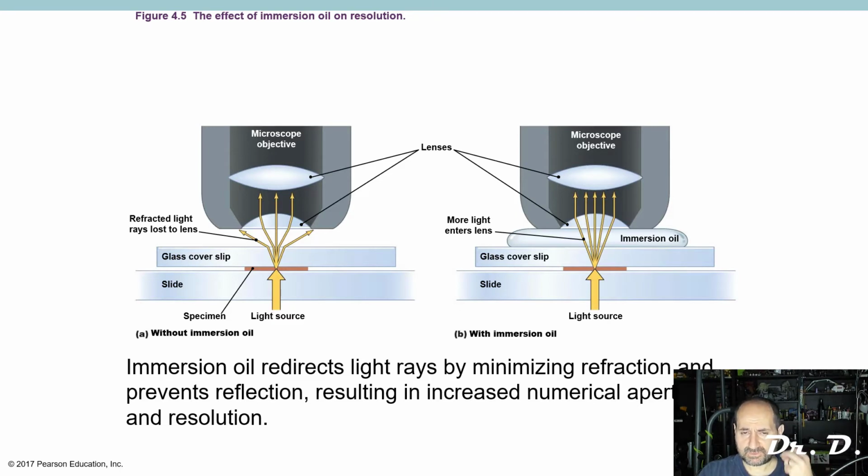But again, for Biology 2420, I don't need you to know exactly how the light bends, but I do need you to understand the concept of refraction. How come when you put a drinking straw into a glass, it looks like the straw is broken? How come it looks like two straws? Or when you put a stick into the swimming pool, how come it looks like the stick's broken and going off at an angle? Well, that's called refraction. That's all due to refraction.